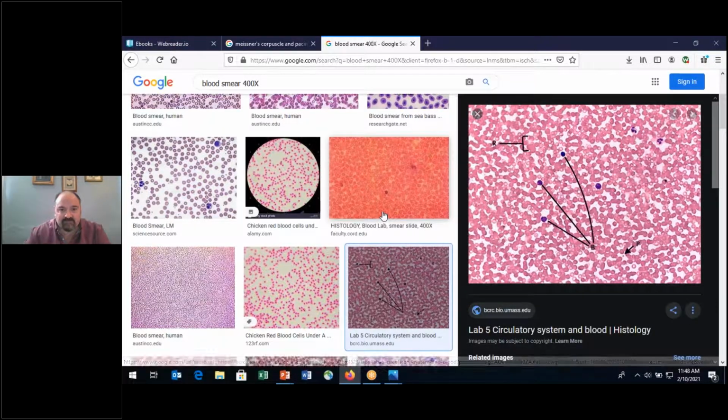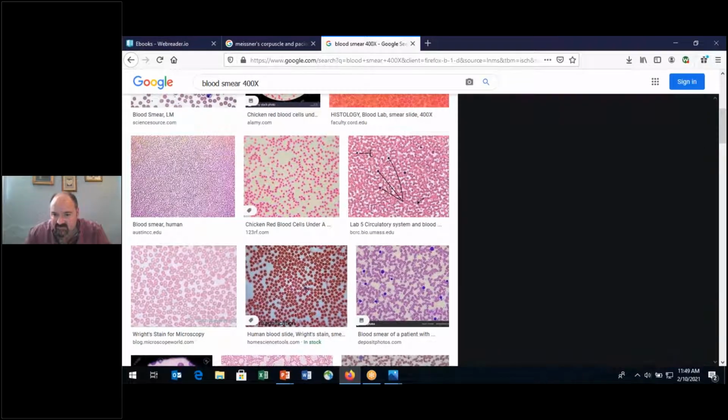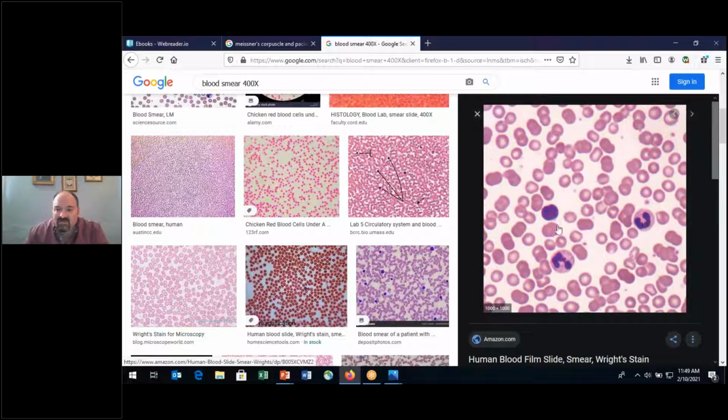So it's very unique in its presentation and what it looks like. Okay. Here's another image. Again, here are 2 white blood cells, and then we have the erythrocytes. And I think that looks like a little platelet right there. Okay. Let's see. Here we go. Leukocytes, platelets, and the rest are erythrocytes, red blood cells. So, of the cells, the majority are red blood cells. That's a blood smear. A blood smear is pretty easy to identify, and definitely looks like red blood cells. It looks like, you know, that's blood. Pretty simple to identify as far as tissues are concerned.